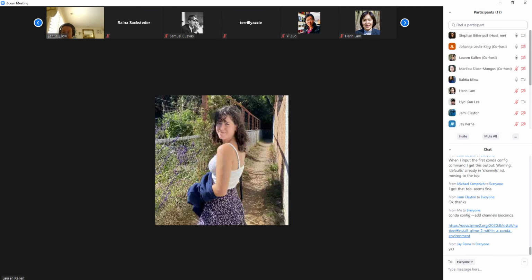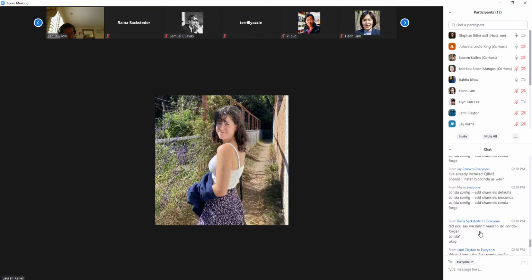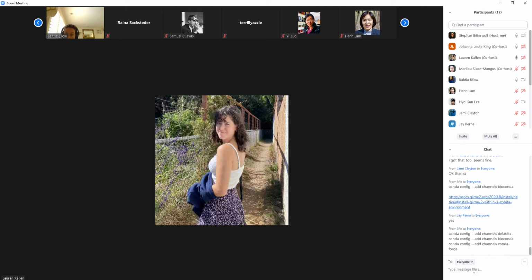You got it. So you do the default one first. So I put in what was in the chat, yeah. And then it should give you a warning on the default. And then you run the BIOCONDA one underneath that. If you ran these 3 commands here, you should be fine. Yeah, I ran those 3 commands. Okay. All right, poof, we did it.